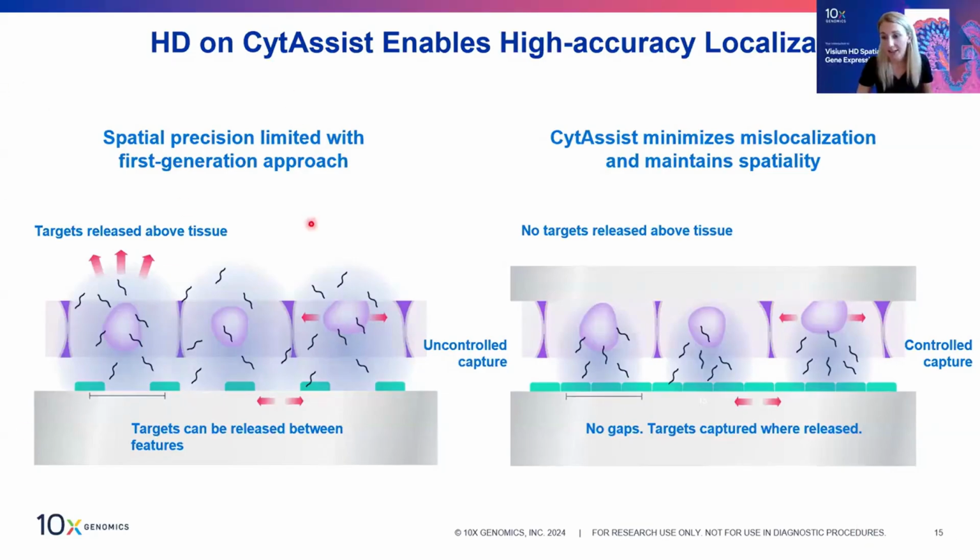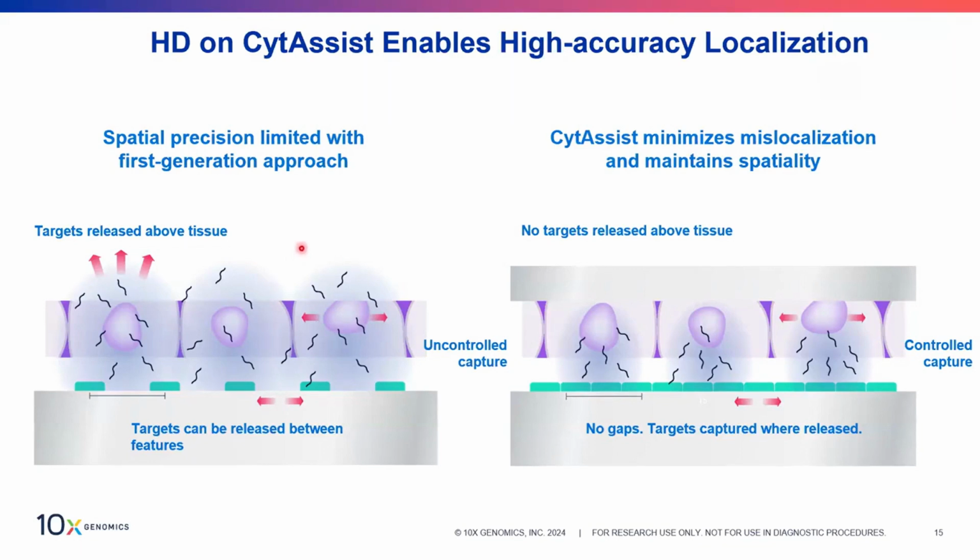And then Damien asked again, are 8 to 10 micrometer sections compatible with Visium HD, or what is the recommended section thickness? So at the moment, the recommendation is 5. Still 8 to 10, I'm not sure. I know we have tested different thicknesses, but the exact range for HD, if it goes up to 10, I would have to check. But I can get back to you about this. Okay.